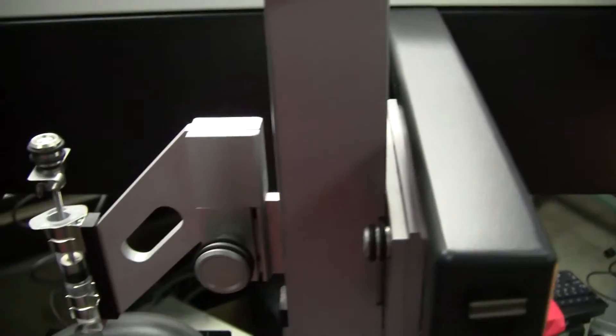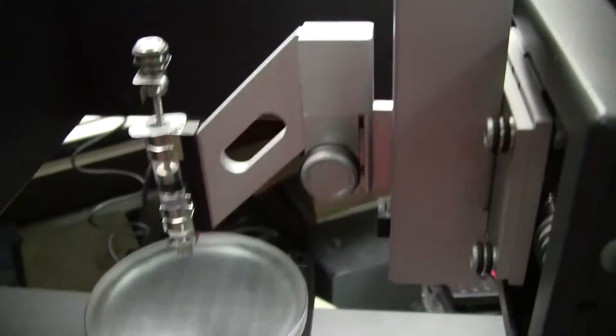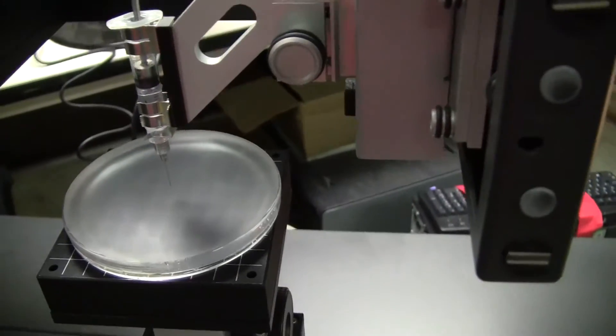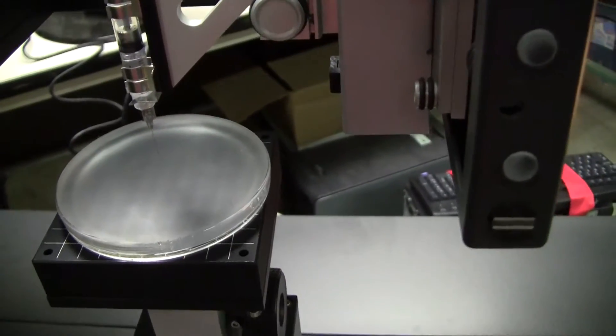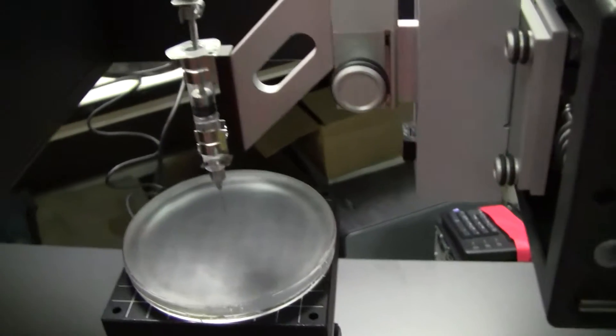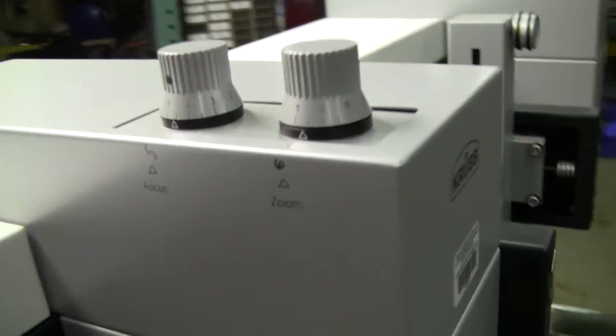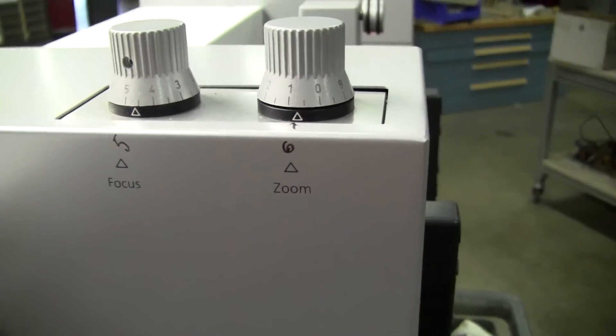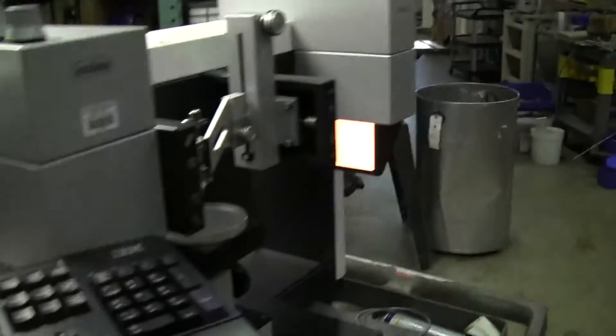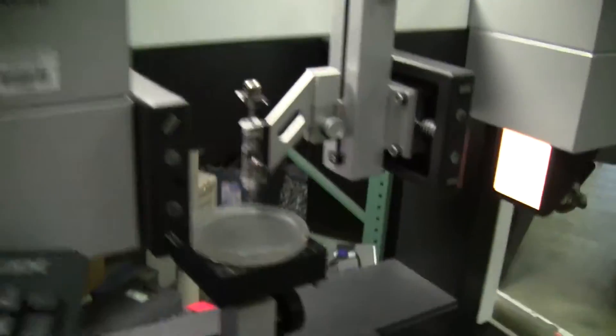The syringe can be moved manually up and down. We have a zoom and focus control and we have software running, viewing the camera.